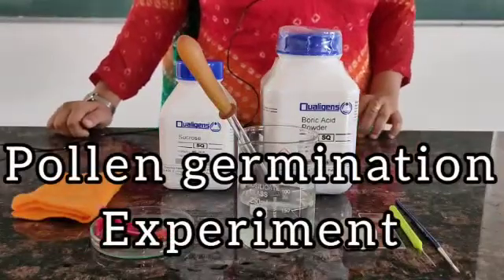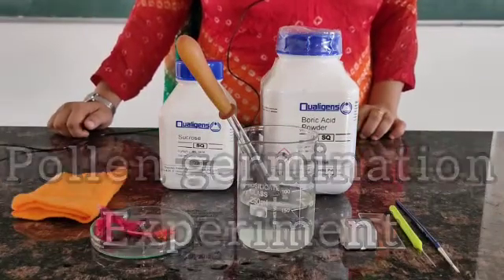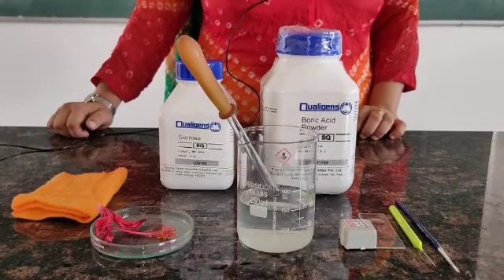Pollen germination experiment. Aim: to study pollen germination on a slide.